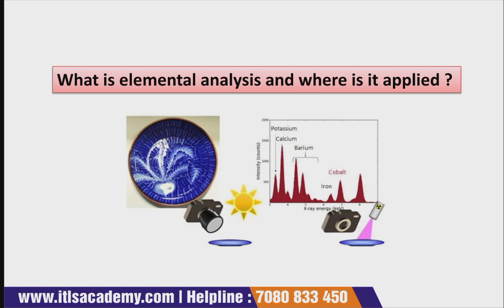If, for example, in a particular sample you want to determine any element, or any element of your interest, then with the help of elemental analysis you are able to do that. This is a very important as well as very useful technique where you want to know the sample of interest.